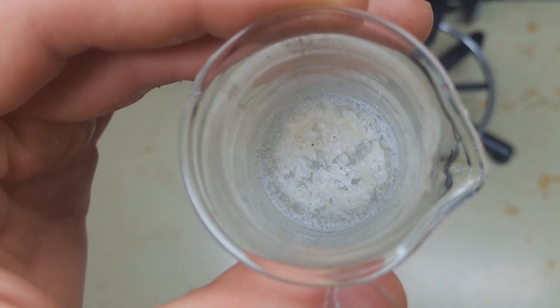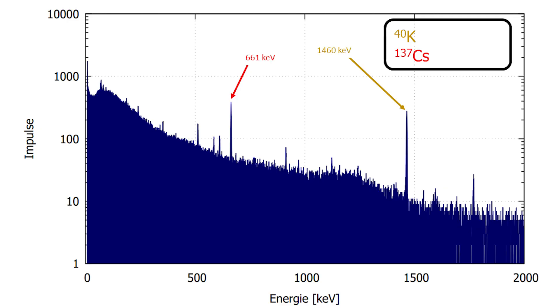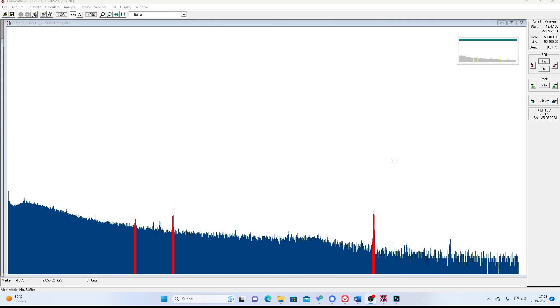I showed you the peaks and now we will calculate how much of each radionuclide is in these bananas. So here's the spectrum shown again in Gamma Vision. The spectrum was recorded over 14 hours and here I've clearly marked the peaks of cesium-137 and potassium-40. And there's a third one, but I will come back to that in the very end. Now, how much radioactive cesium and potassium is actually in these bananas?